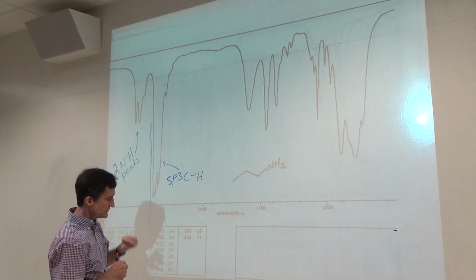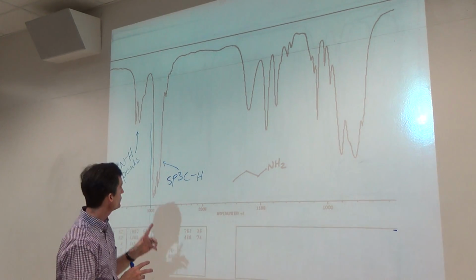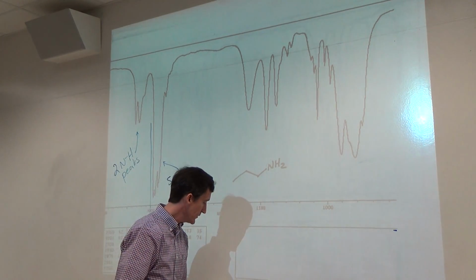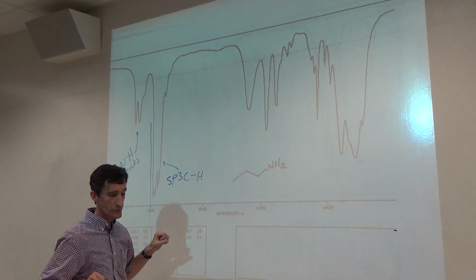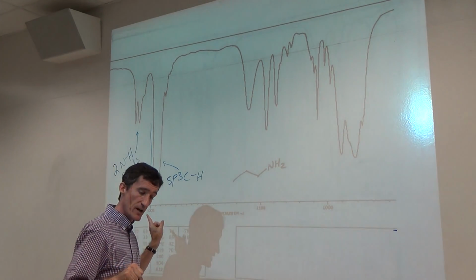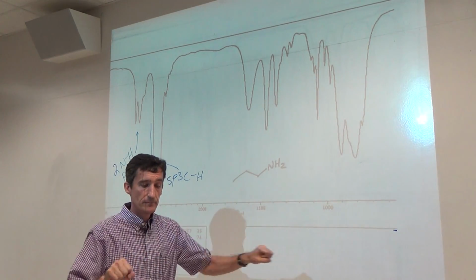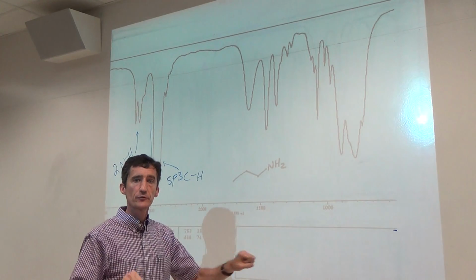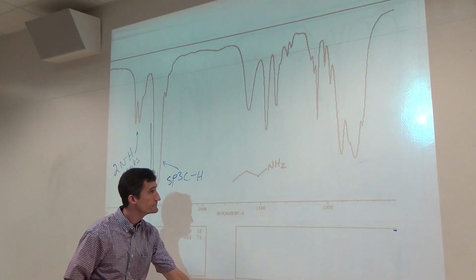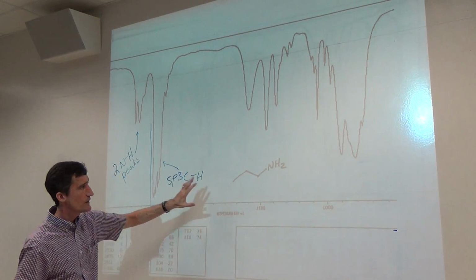One thing I can say about these two peaks down here, it's not two individual NH peaks. This is sort of just a minor point. It's actually where one of these absorbances is from the symmetric NH2 stretch, and the other absorbance is from the asymmetric NH2 stretch. And these have different frequencies, leading to two different absorbances. But in the end, two peaks typically means two NH bonds.